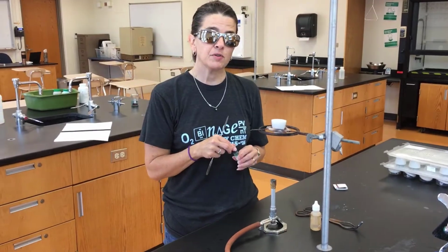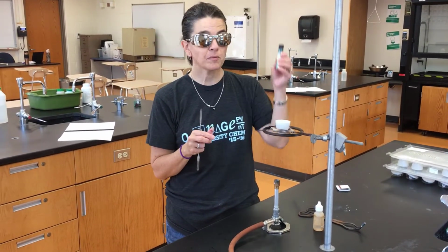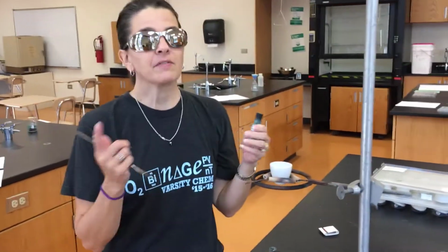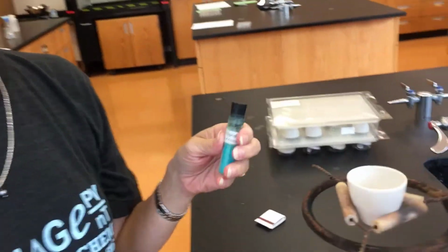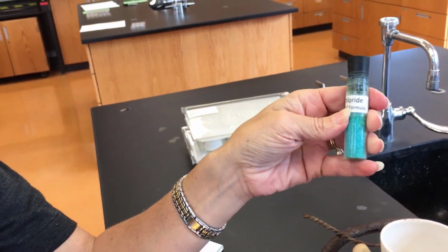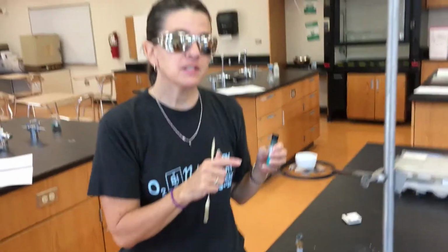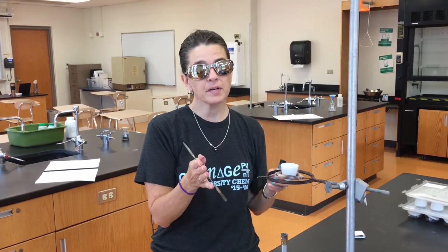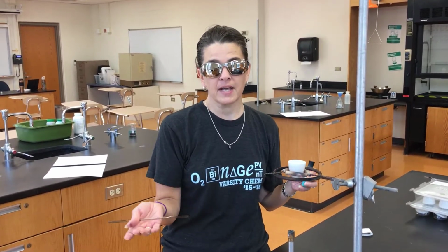For today's lab, you're going to be determining the empirical formula of some compound of copper and chlorine. However, we're adding a twist to it. So you know there's two possible compounds of copper and chlorine. We call them copper chlorides. But this is what we call a hydrated copper chloride. So it's not just the copper chloride compound, there's also water attached to it.